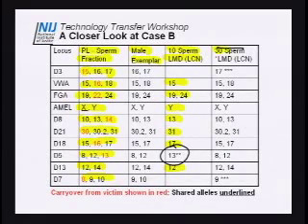But after the mini lysis procedure that I performed, I was able to collect 30 sperm rather quickly and almost a full profile. I think I only had, on D3 and D7, dropout. But other than that, a nice profile.